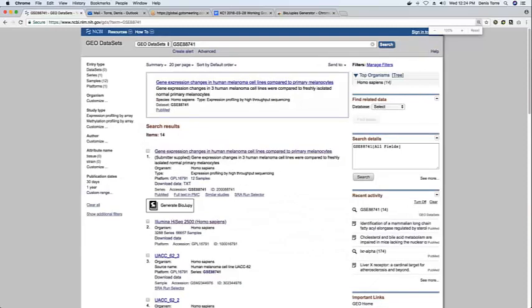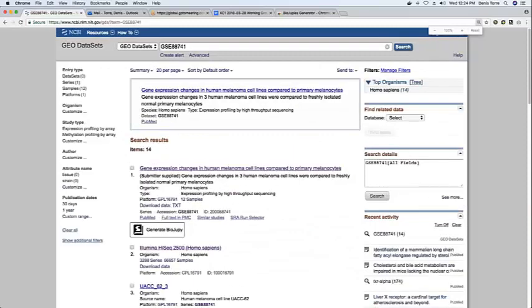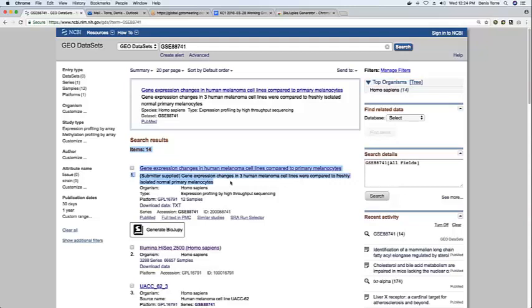The interface shown here is the search results page for a specific dataset on the gene expression omnibus. So the results, for example, in this case we searched for a dataset which measures gene expression changes in human melanoma cell lines compared to primary melanocytes.